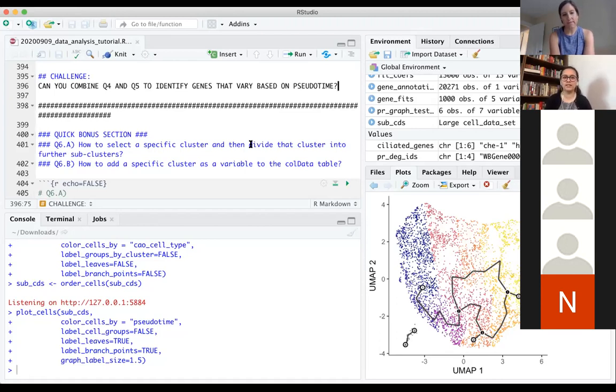So that's one of the big things. Now, through this tutorial, you have all the functions for the graph test as well as the pseudo-time test. So when you go back to your data, you can merge the two steps and see if you can find significant and reliable changes in gene expression along your different branches, if you have time series data.